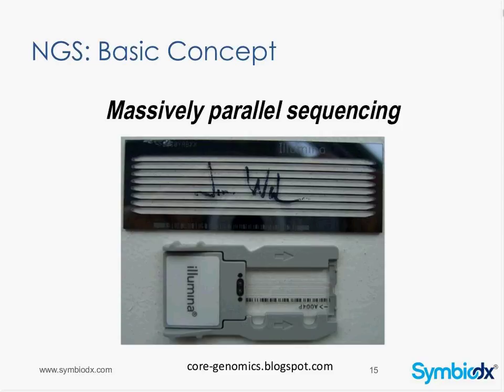These are flow cells. This one at the top is a HiSeq flow cell signed by James Watson, interestingly. This is kind of the top-of-the-line, biggest application instrument made by Illumina. This cell down here goes on a MiSeq. This is what we're using for our assay, and you can see that it's much smaller. I should say this is the one that fits 30 million fragments, so you can imagine that this is dramatically increased. The advantages to using a MiSeq are that it is faster and it's more accurate currently than using the HiSeq, and I'll go over that in a little bit more detail momentarily.